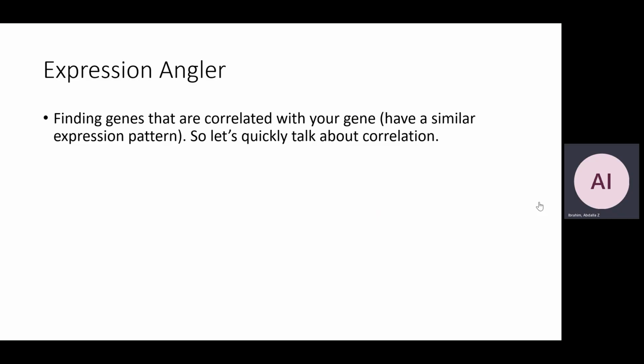Okay, so welcome to the Genetics Lab. The Arabidopsis project's goal is to identify the function of an unknown gene. We have already done BLAST to find any orthologs in other species, and also to see if there are any specific conserved domains. And last week we did eFP to see where the gene is expressed.